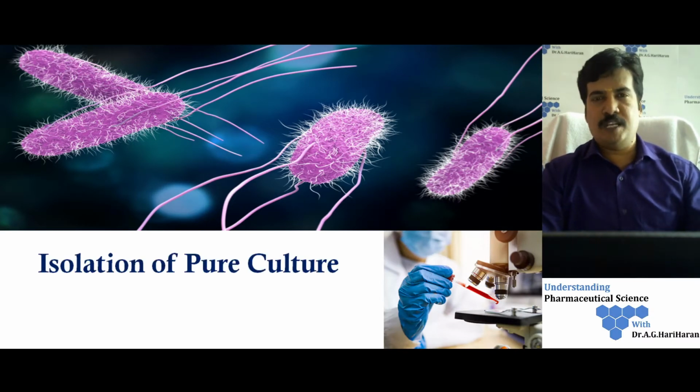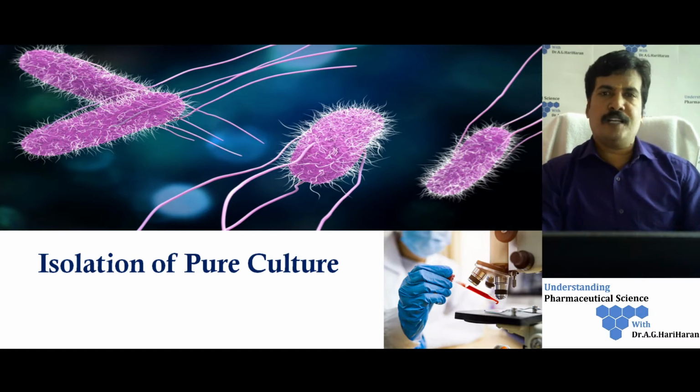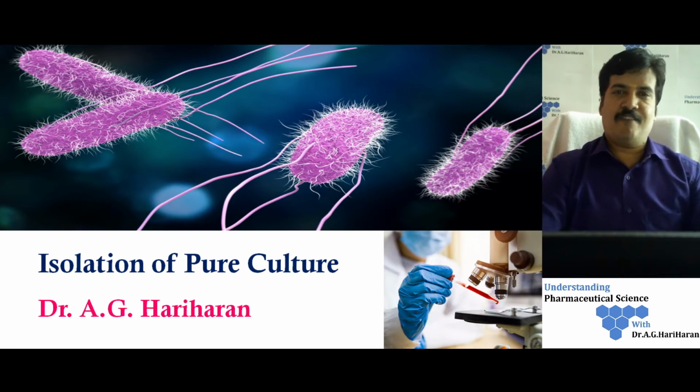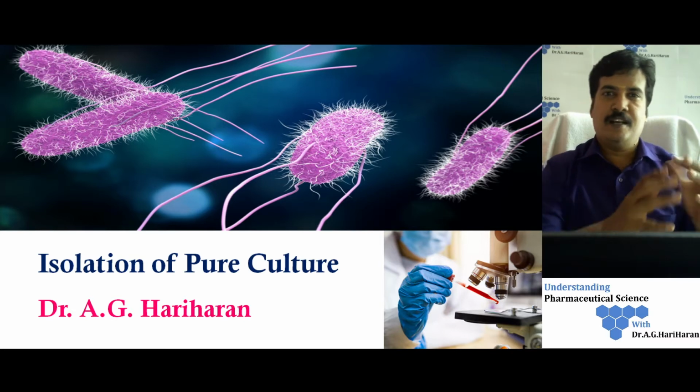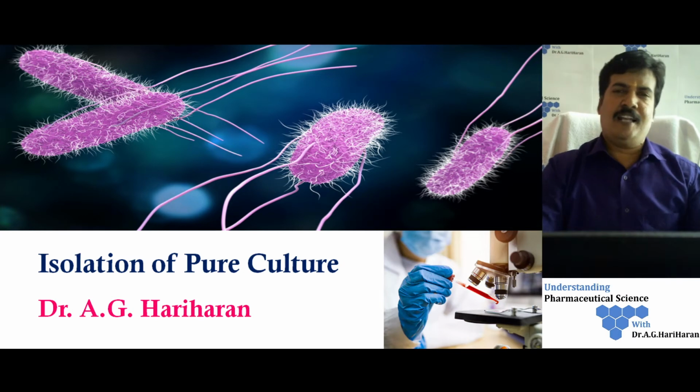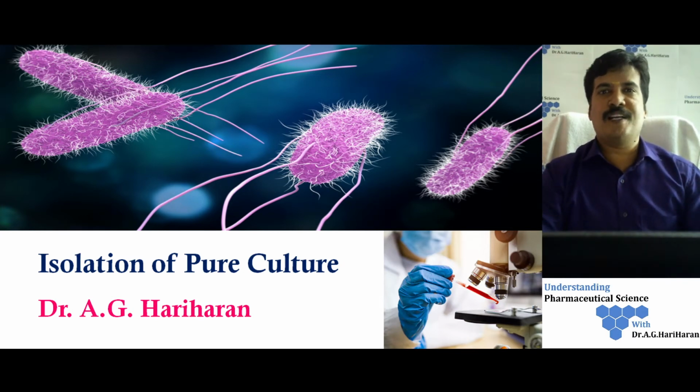So today we are going to discuss the isolation of pure culture. It is one of the very important techniques in pharmaceutical microbiology as well as in microbiology as a whole, because microorganisms are present in nature as a mixed culture, and they should be isolated into a pure form. In this lecture I have elaborately discussed what is meant by a mixed culture, a pure culture, and the basic principle behind the isolation of the pure culture. The second part of my lecture discusses the various methods which can be used for the isolation of the pure culture.